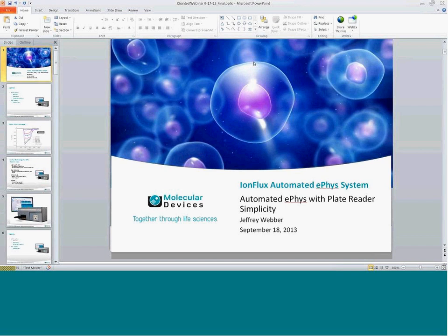Okay. Excellent. So, good morning. I'm going to be talking a little bit about the IonFlux system today. The IonFlux is a recent addition to the Molecular Devices product line.